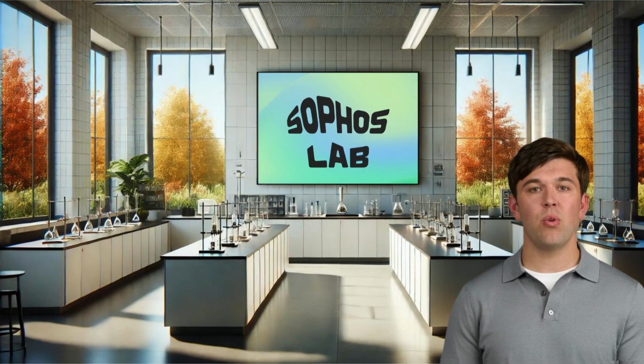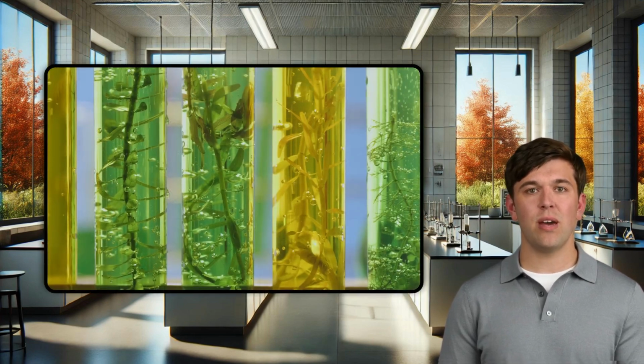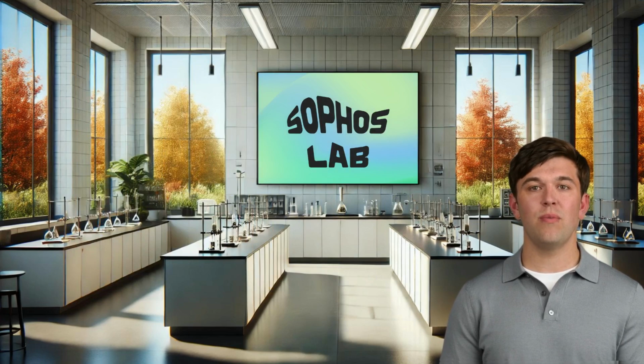Today, we are going to build on this foundational knowledge by conducting a practical investigation. By manipulating the light intensity, we'll observe and measure how it impacts the rate of photosynthesis in an aquatic plant, which brings the theoretical aspects we've covered into a real-world context, giving you a deeper understanding of how photosynthesis rates can be quantified and influenced by external factors. So, let's dive in and begin our quest to uncover the intricate relationship between light intensity and photosynthesis.